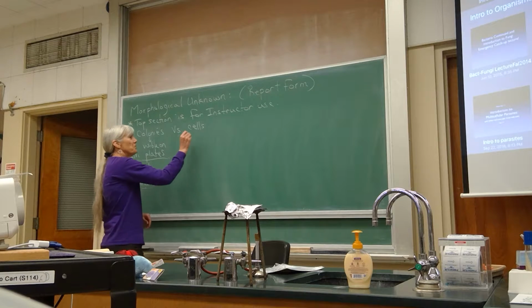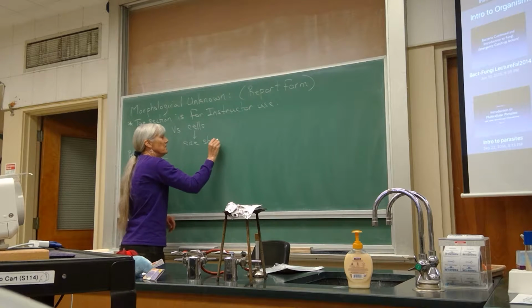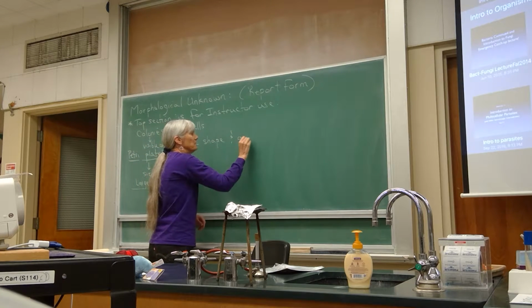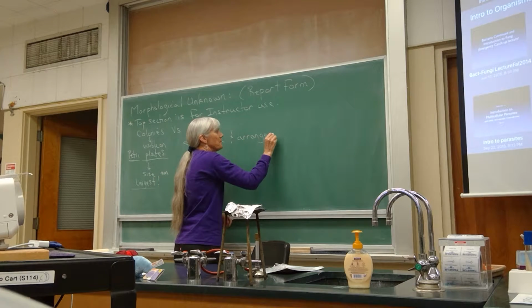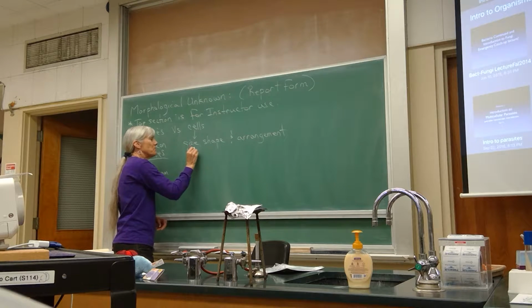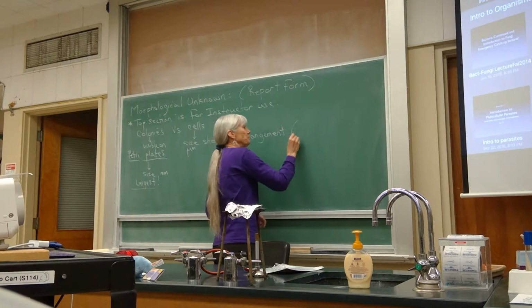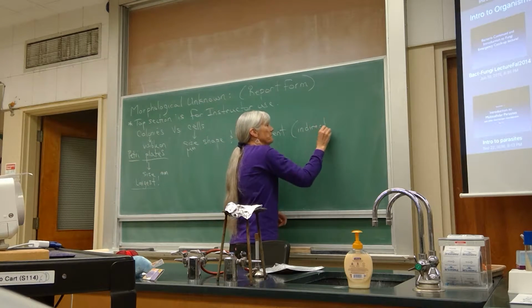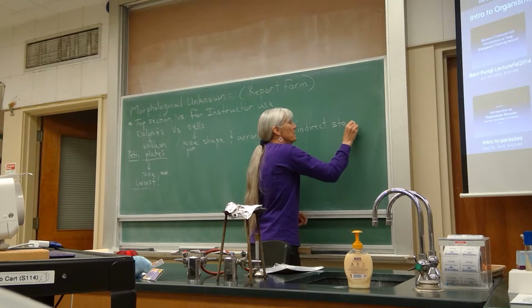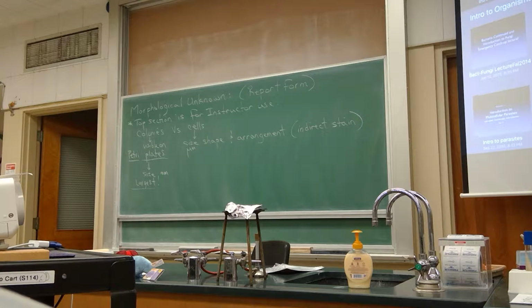So then you have cell morphology. Well, first of all, you have size, shape, and arrangement. To get the most accurate size, and this is in microns, micrometers, use your indirect stain. Some of you did those from the broth tubes initially. If you didn't get good results from the broth, just go back and do it again. This is a really quick preparation. Cells in water, a little loopful of nigrosin, spread it out, let it dry.